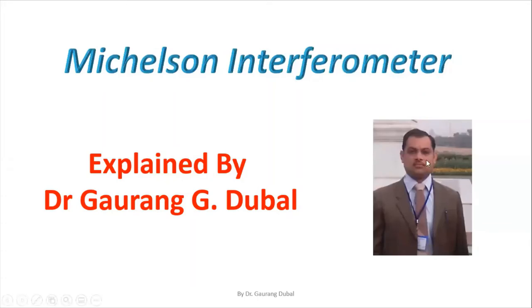Hello and welcome. My name is Dr. Gaurang Dubal. Today I am going to explain the Michelson interferometer. The Michelson interferometer is an instrument which may be used in IR spectroscopy. Now we are going to see the topic in detail. First we will see the principle, then the instrumentation part, the schematic diagram and all the details.